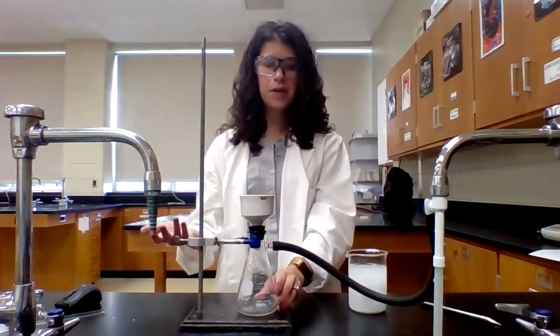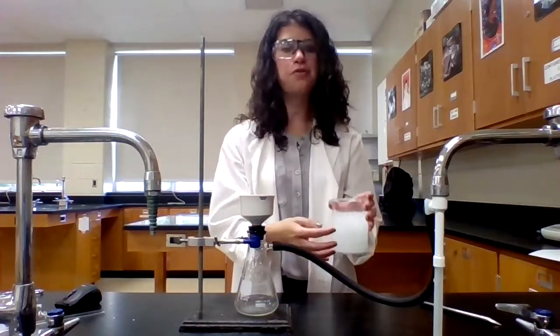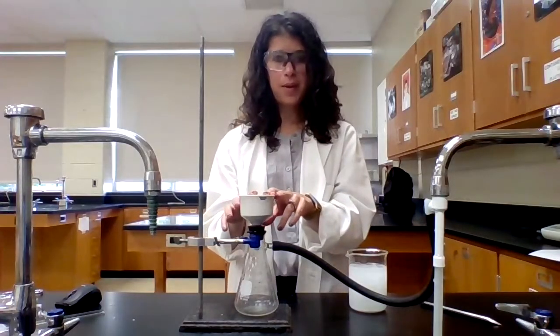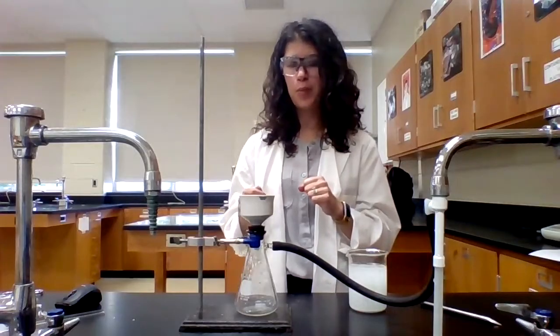So the advantage of doing a vacuum filtration over a gravity filtration is simply speed. A vacuum filtration is going to allow me to filter 400 milliliters of solution much more quickly than a gravity filtration would allow. So I have already weighed out my piece of filter paper using my analytical balance, and I've recorded that mass in my lab notebook.